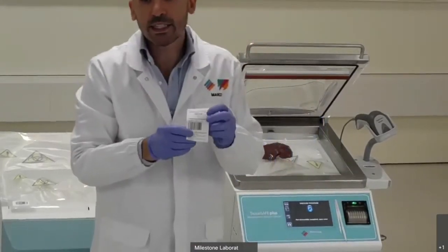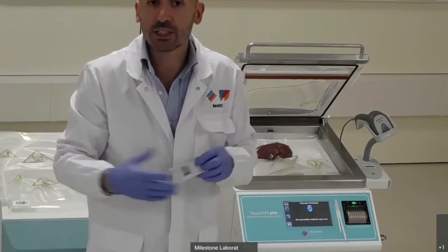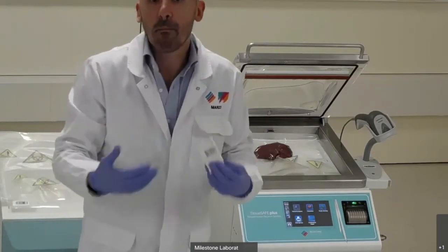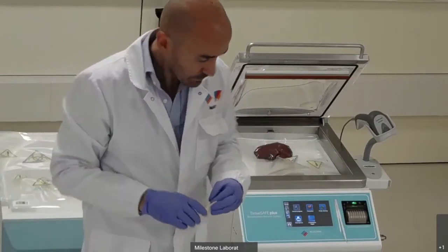On this level here, now I do have all the information of this procedure, such as date, time, which kind of level of pressure I applied, and also the identification of the operator who has done the procedure.